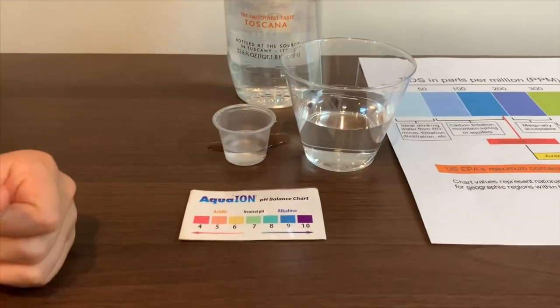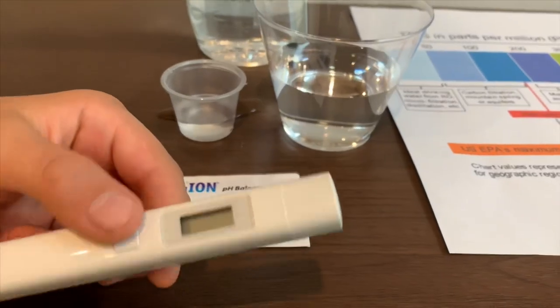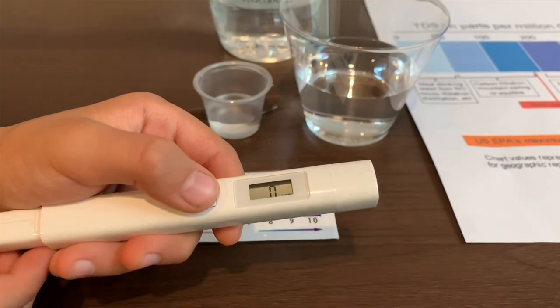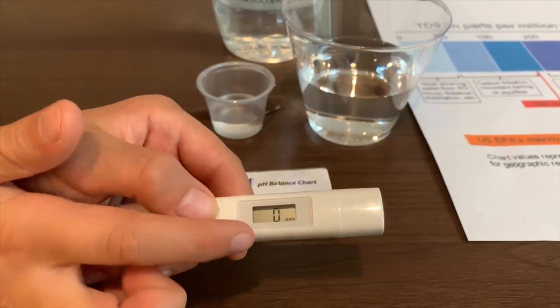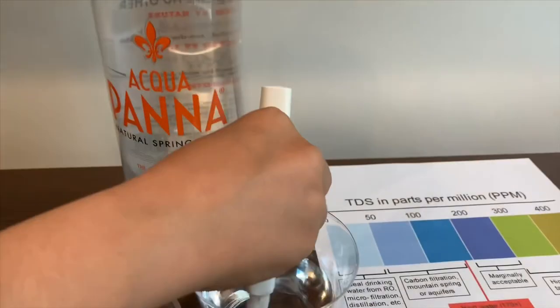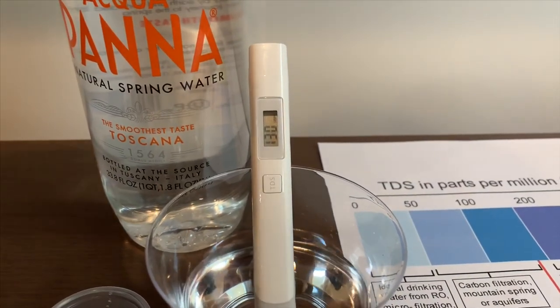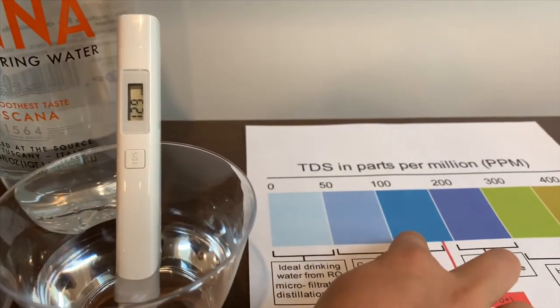First we're going to test the TDS. If you want to buy this TDS tester, check the link down below. Turn on the TDS tester, make sure it says zero, and put it in — 130. That is okay to drink.